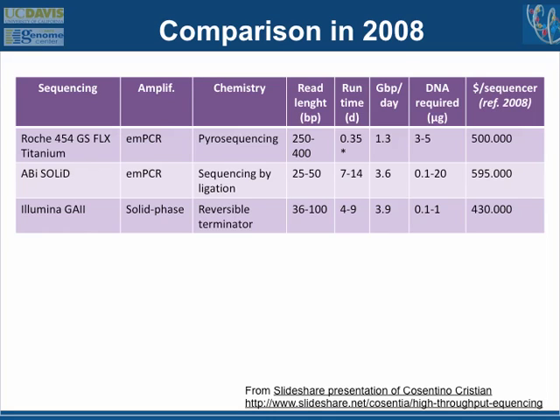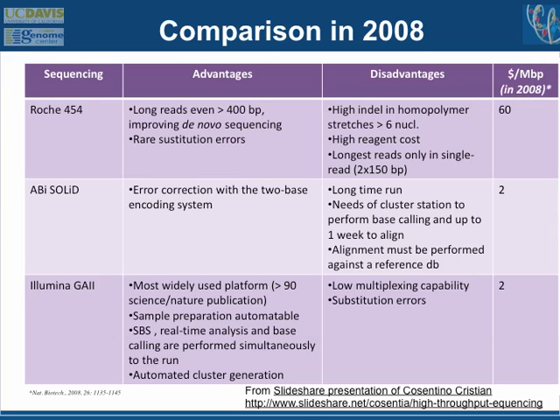And this was the old Illumina sequencing, when people were only getting about 30 to 90 bases of DNA sequence out of it. The new Illumina sequencing is by far and away the winner in terms of cost relative to these other systems. So if your goal is to generate a lot of sequence data, figuring out how to do something with the Illumina machine is probably your best bet, even today, even though we'll talk about some of the fourth generation sequencing methods.